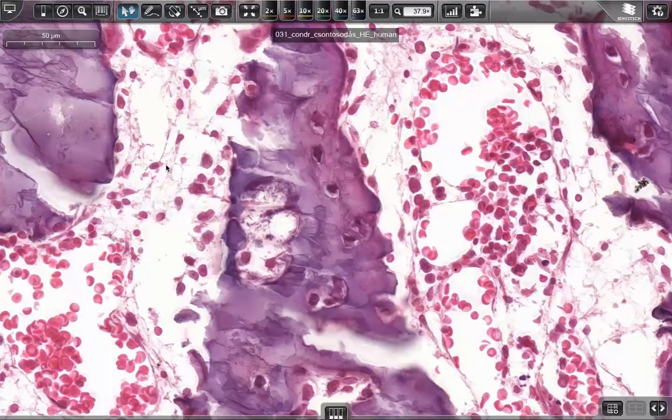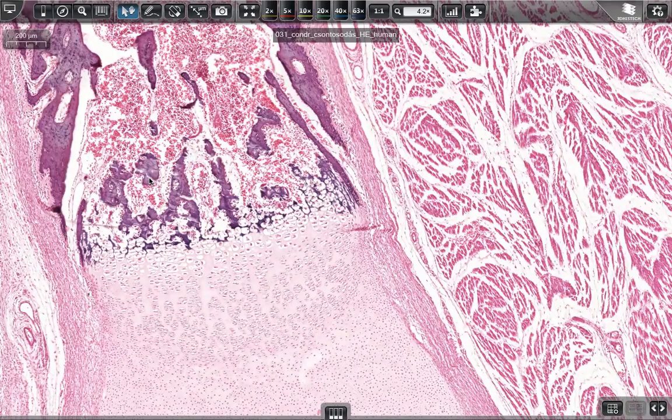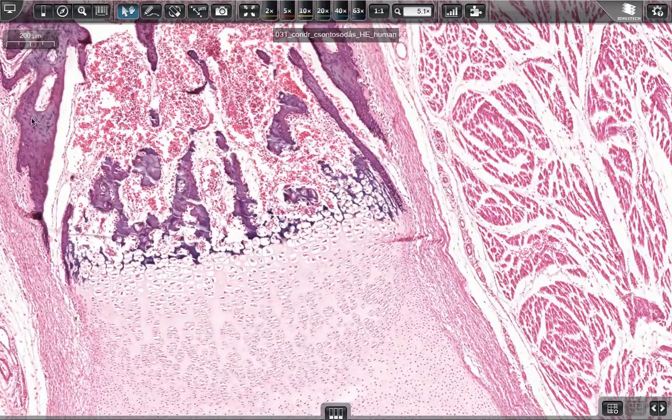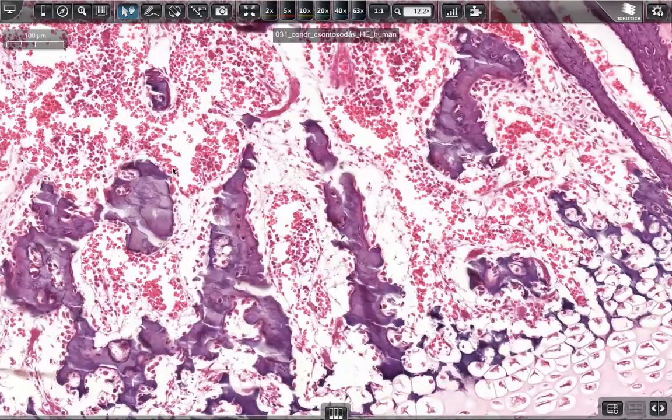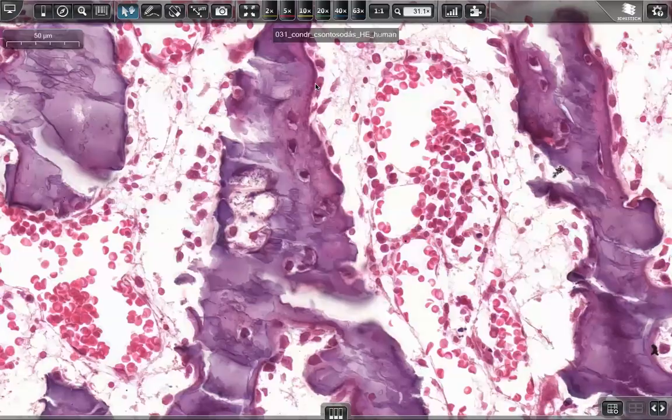You know, the cartilage matrix breaks down because of the deprivation of nutrients, forming large cavities. And with the vessels penetrating the bony wall, because it's a vascular tissue, mesenchymal cells enter into the bone marrow cavity and differentiate into osteoblasts, just lying onto the surface of the cartilage. So look at that.